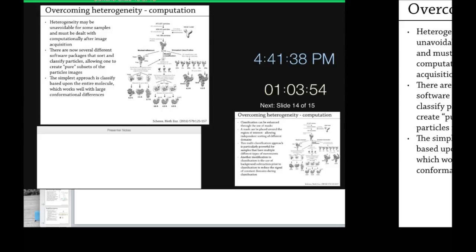One way, depending on how big the conformational differences are: if they're using auto-picking, there's usually a low-pass filter that you apply to the reference, to the templates, and to the images. With Relion, I generally use a 25 angstrom low-pass filter. And so often if you have a subtle conformational change, the difference between them isn't going to be that big.